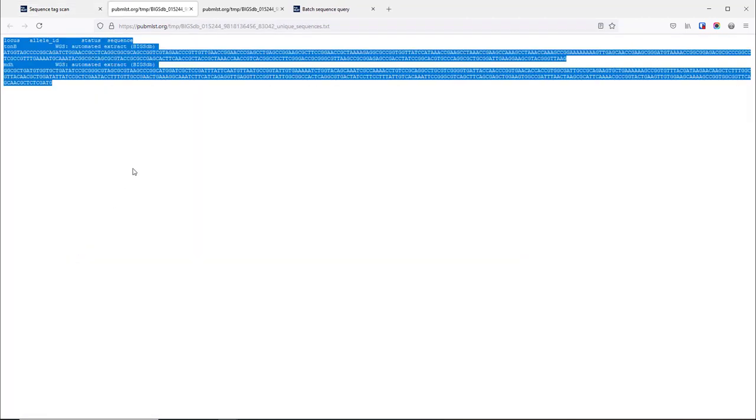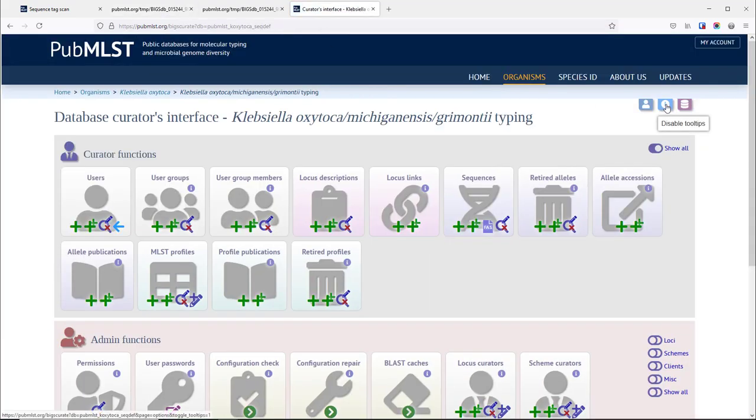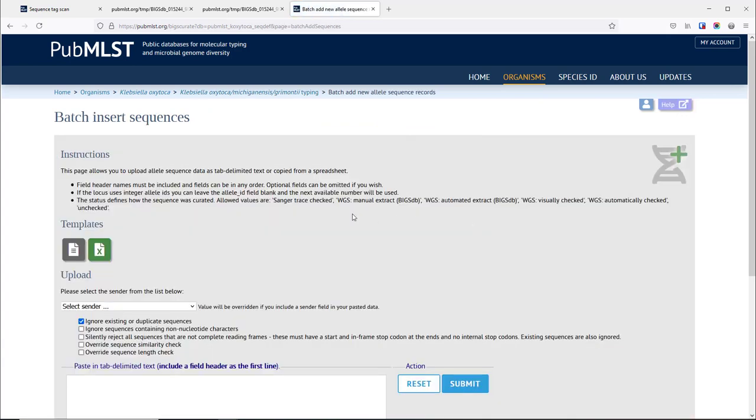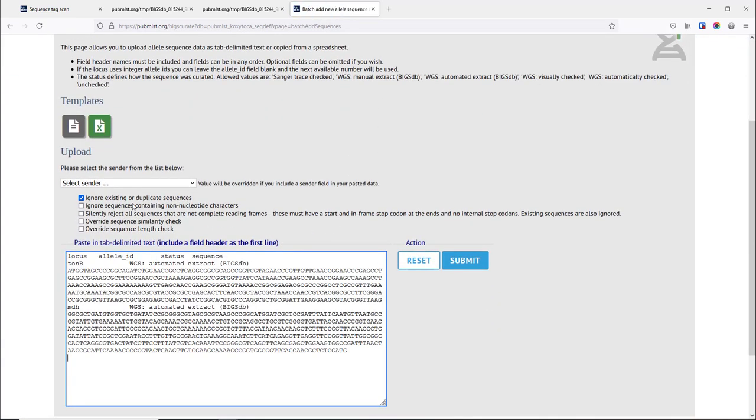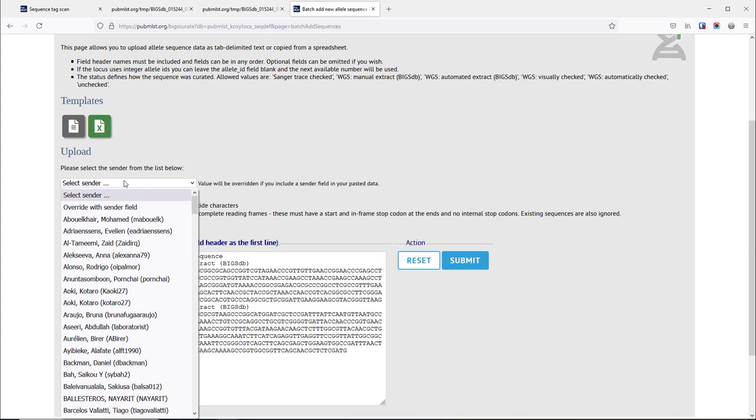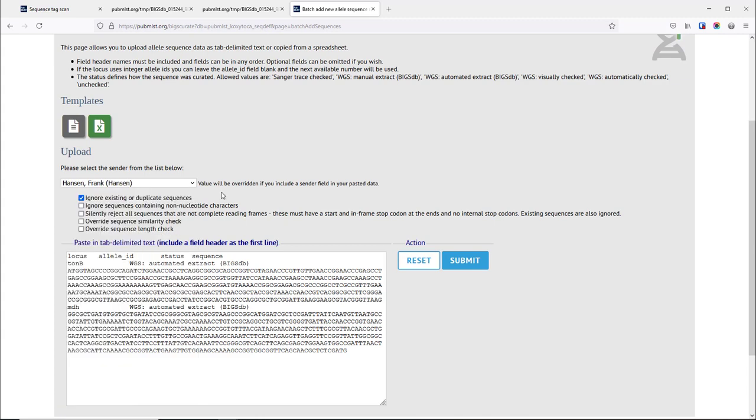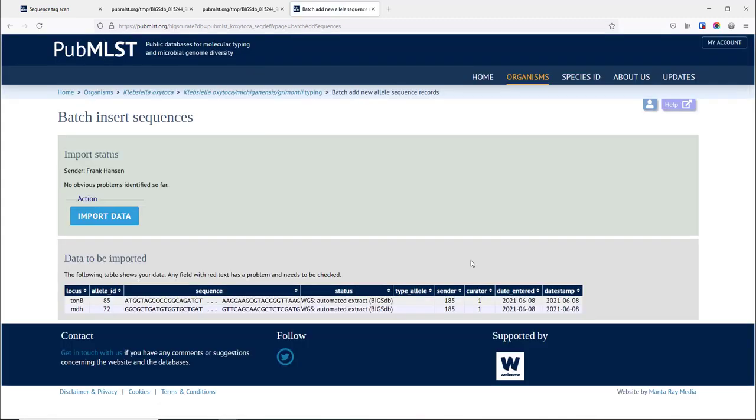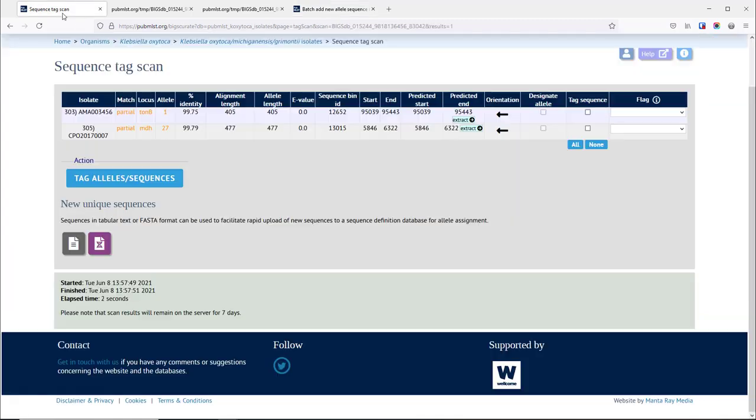Finally we can use a tab delimited text file that's produced and go to the typing database and add those sequences in a batch mode just by copying and pasting that output file. We select the sender, click submit, these get checked, and finally you can upload these into the database for assignment.